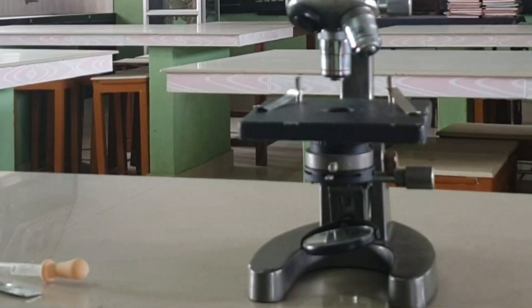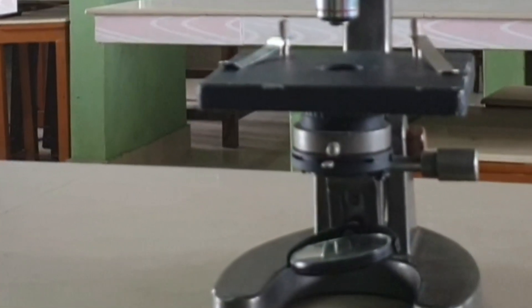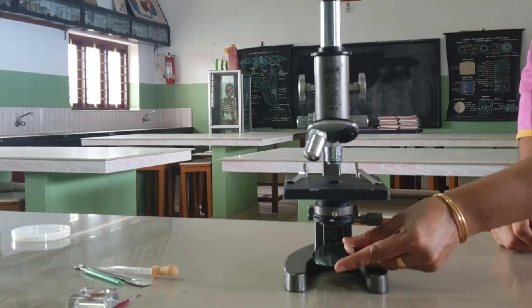Mirror is attached to the lower end of the arm or the pillar. There are two mirrors: a plane mirror and a concave mirror. It is used for reflecting light rays into the microscope.